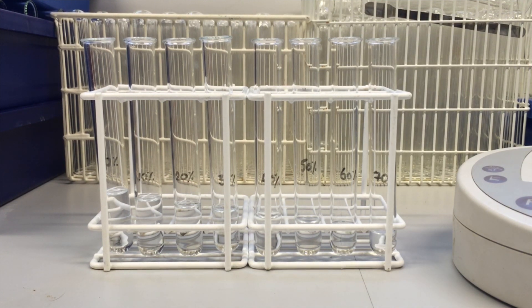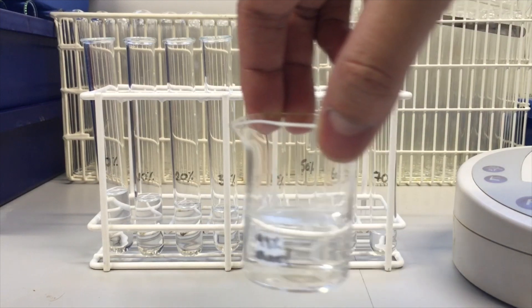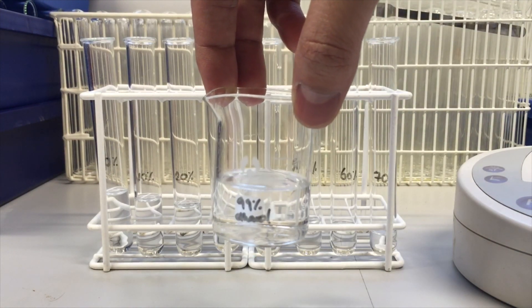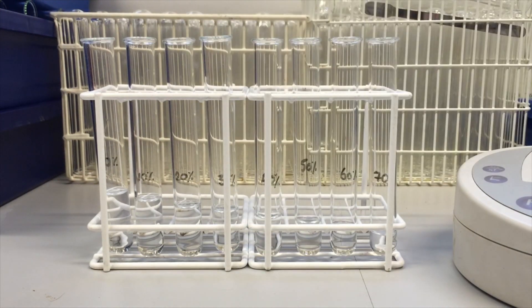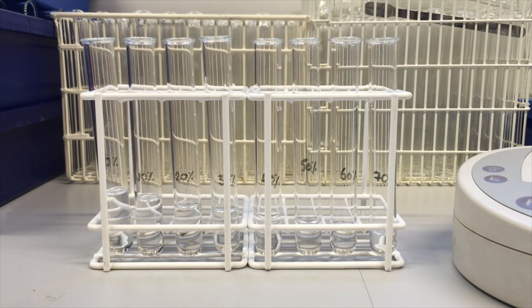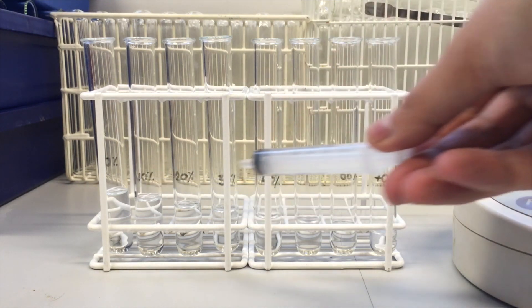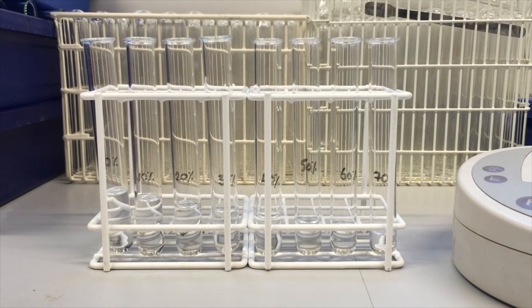So what I'm going to do now is I've got some 99% ethanol here, and what I'll be doing is adding gradually increasing volumes of this to my existing volumes of water to make it up to a final percentage of alcohol as labeled on the tubes that you can see there.